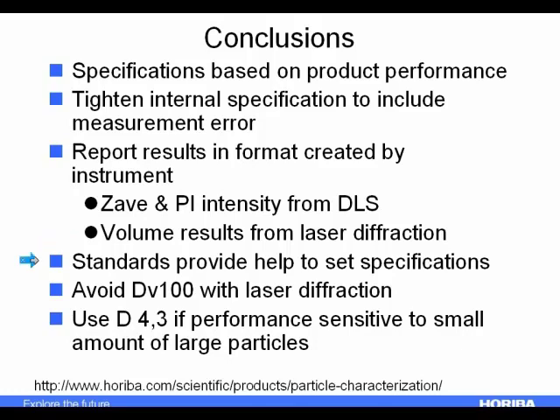Look at the standards. They provide good guidance on suggested good practice, and also on how to benchmark yourself against other labs to understand how to test our reproducibility. And just a few other hints before I wrap up: avoid using the D100 with laser diffraction, and only use the mean value, the D43, if you want to be more sensitive to the presence of large particles.